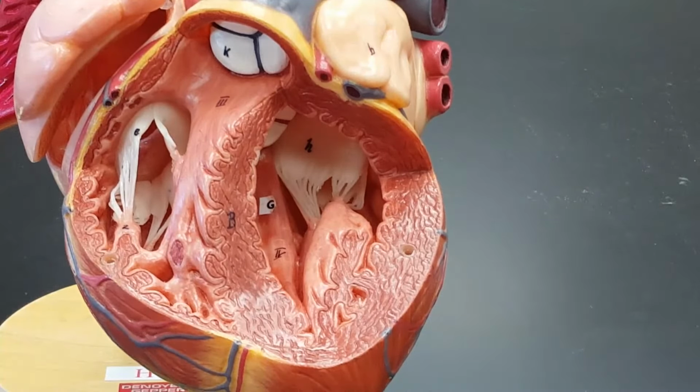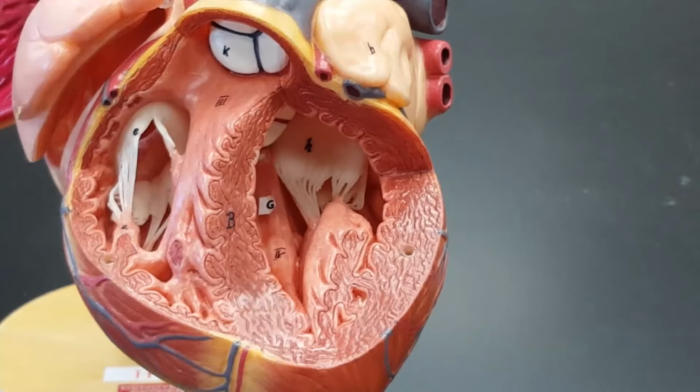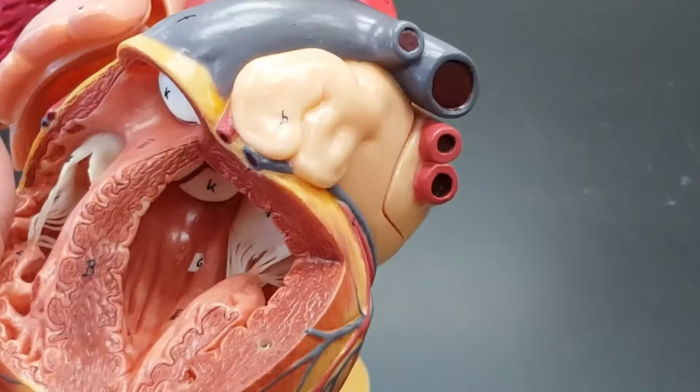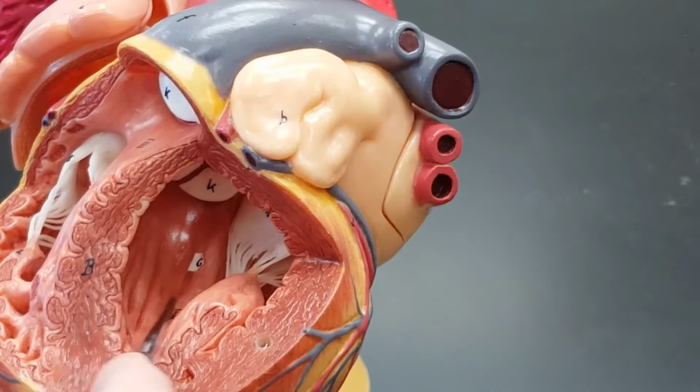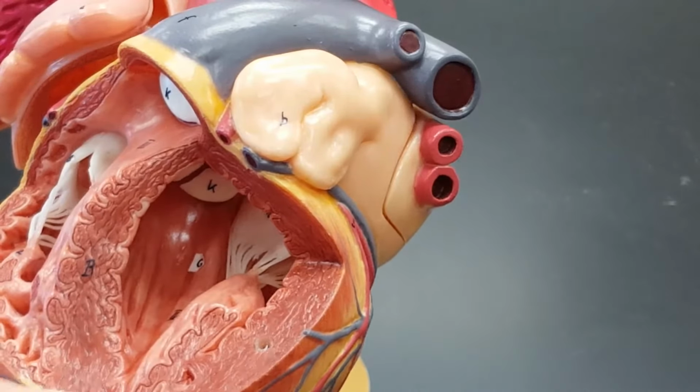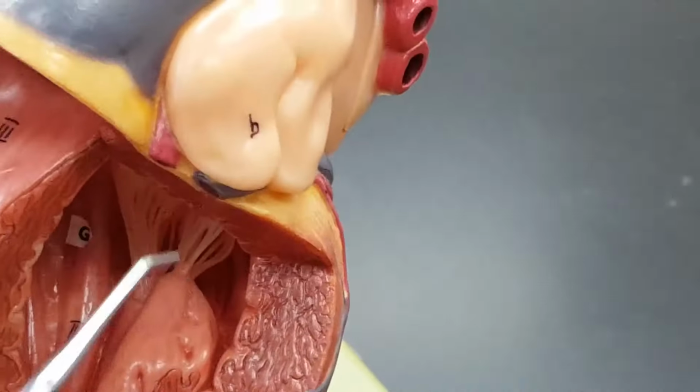I want you to think back to 223. Trabeculae are an irregular network, shards, pieces of something. Think of the trabeculae in your spongy bone as an example. This is a name we often reserve to describe the irregular ridges, see this, in a ventricle. You can hear my probe bouncing across that roughness. Not the papillary muscle.